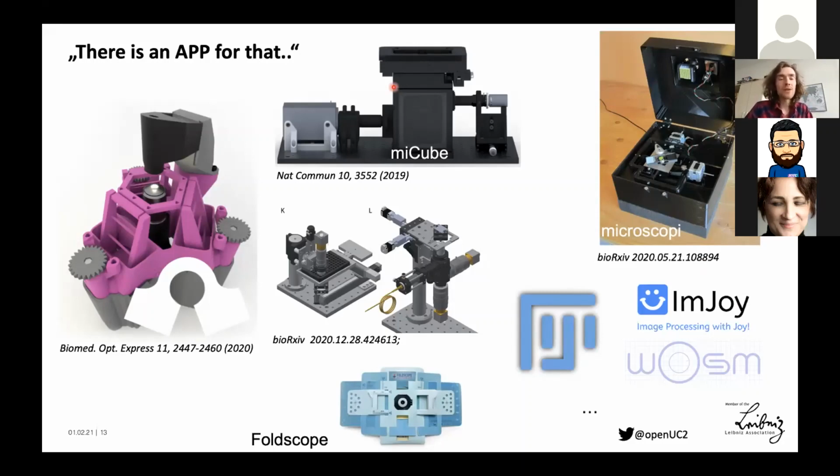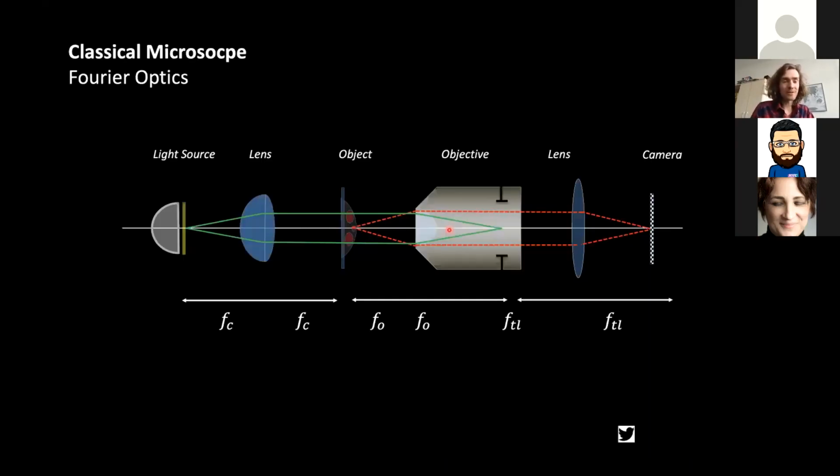And so we thought, okay, there's so much variety in the community. It's all nice, but in the end, we would really like to have some kind of a standard, which I'm always stressing. And if you observe microscopes, of course, well, most of you are familiar, it starts with, for example, an illumination, which is eventually then reimaged with a lens, like a condenser. Then you have your object. The object is scattering light, or eventually also fluoresces. And then you have a detecting objective lens, a tube lens, and a camera.